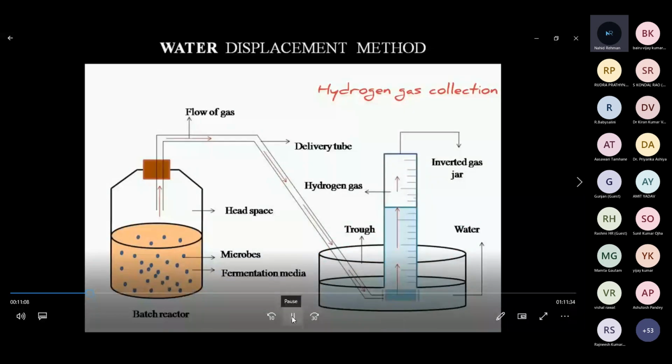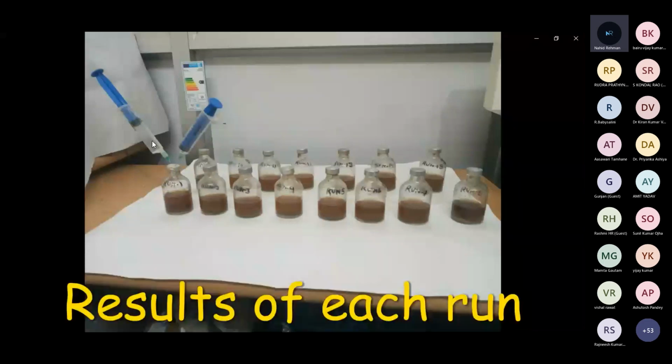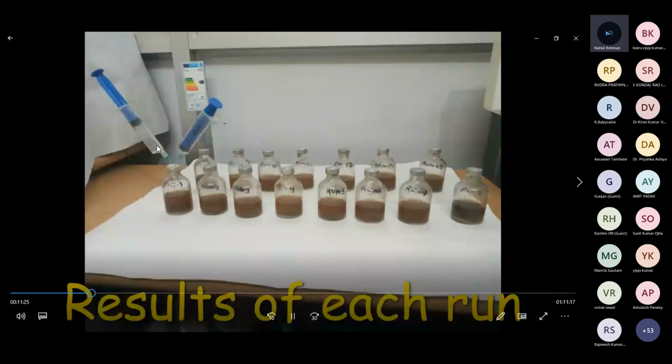Now this hydrogen gas can be collected in the syringe as well, and then that gas has to be analyzed through the gas chromatograph, and that is done by pressing the plunger 2-3 times. So you collect the gases from all the bottles in different syringes, and then it can be analyzed by the gas chromatograph. I'm forwarding it so that you will be able to see it. As you already know what is gas chromatograph, Soumya has explained it.